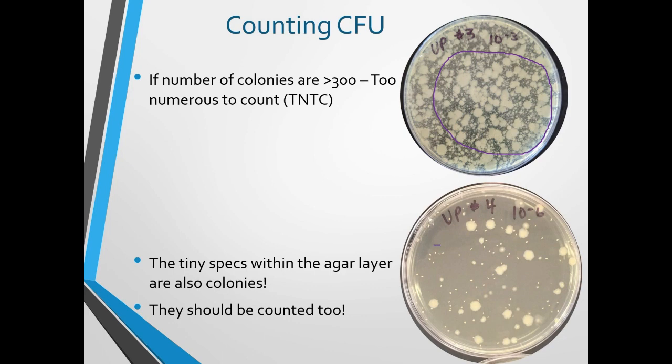And if your plate has tiny speck-like things embedded within the agar, they are also colonies. If you remember, we mixed our sample with the agar when we poured these plates and then we let it solidify. So these are colonies that are forming inside the agar layer. So they should be counted too.